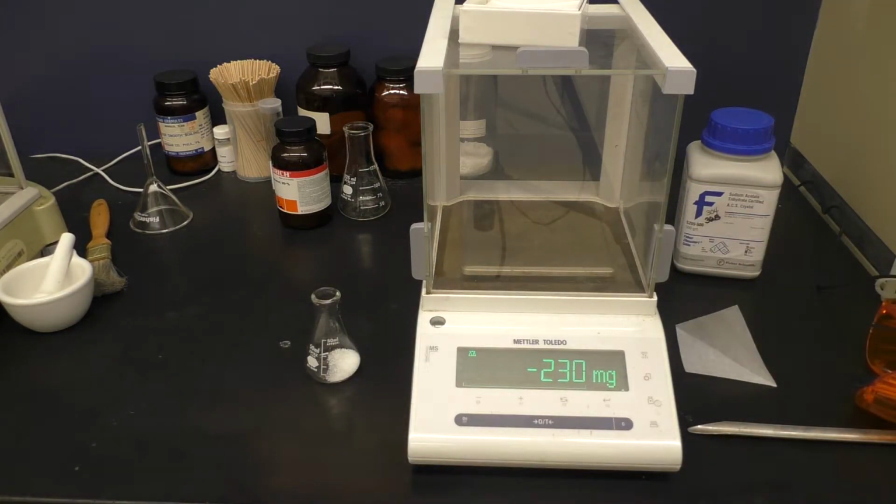And then we'll measure out 10 milliliters of distilled water and add this to the flask and dissolve up our sodium acetate to make our sodium acetate solution.